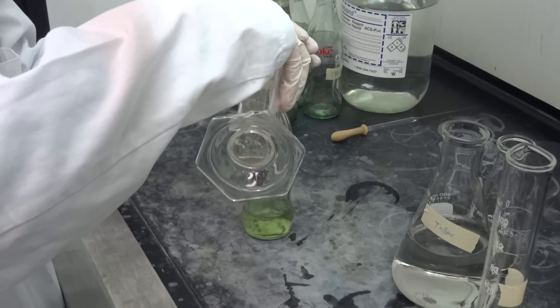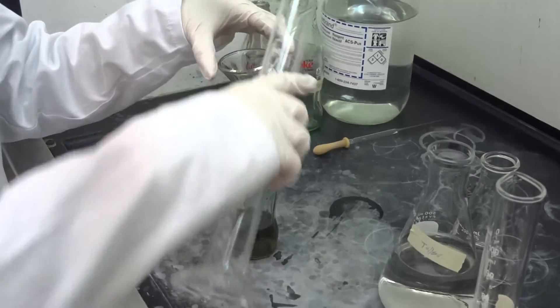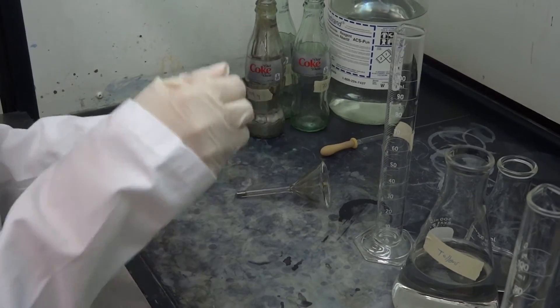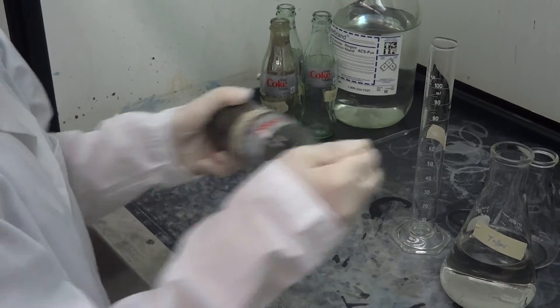So she's adding — there it goes. You're not going to see... there you go. So it turns dark pretty quickly, which means that colloidal silver is being formed. And now she's putting the stopper on and going to be shaking the Coke bottle. It actually kind of looks like Coke in there right now.